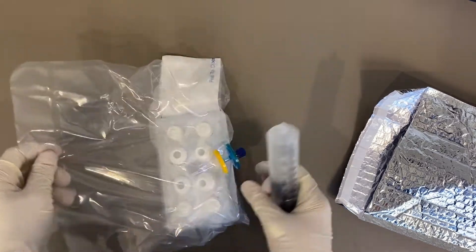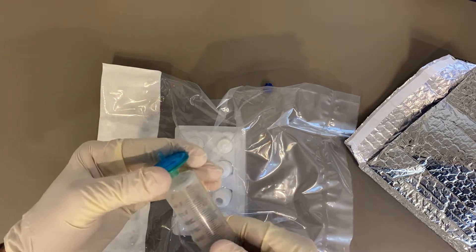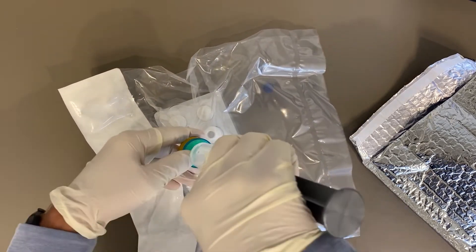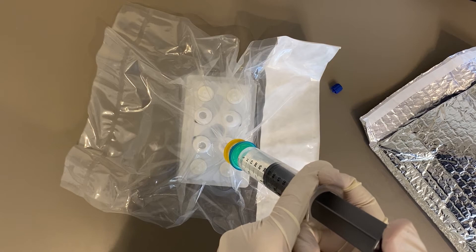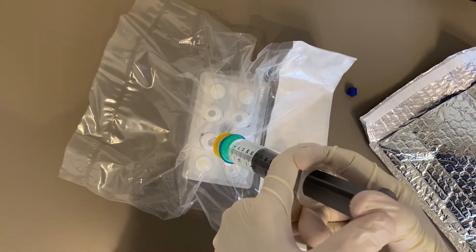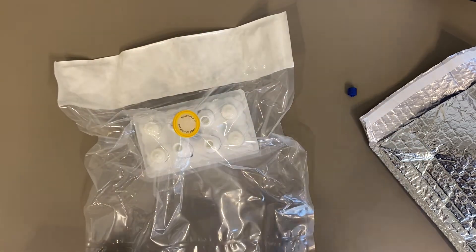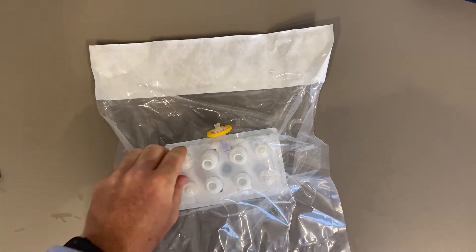I throw away the used syringes and vials, then open the sterile bag filtration system. I couple it to the 0.9 micron filter, which is then coupled to the sterilizing grade 0.2 micron filter. I push 10 cc's per bottle through the filter into each eyedrop bottle. There's some resistance, but it flows pretty well. I work clockwise so I know where I've been and where I need to go. When the final bottle is filled, I throw away the syringe and remove my gloves — it's easier to cap the bottles without gloves on.